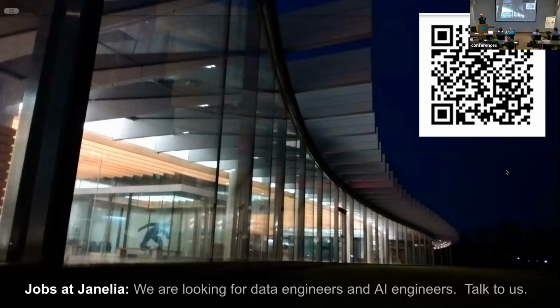Do you believe that in a few years it will be like a video game that we can access really easily, and we can simulate the experiments before they happen? I don't know if I get the question right, but most of these applications that I showed you are made like video games. You can drag and drop things and move them, you can paint and stuff like this. Particularly WebKnossos has a tracing mode where you fly through the neurons and it tries to render them like a video game. I found it not so useful, but it's fun.